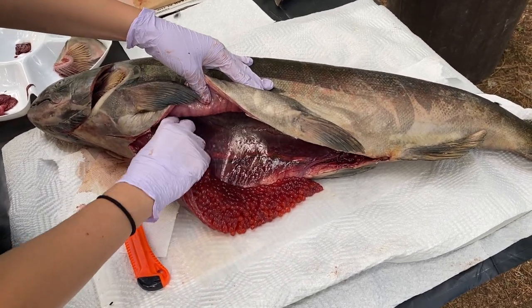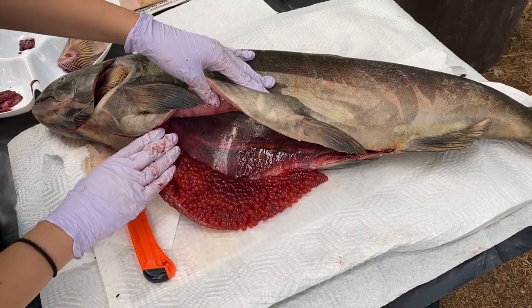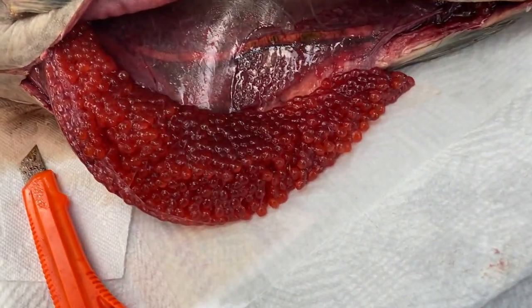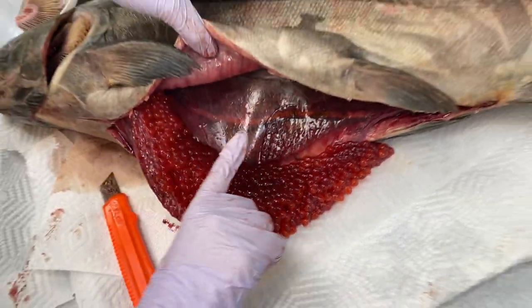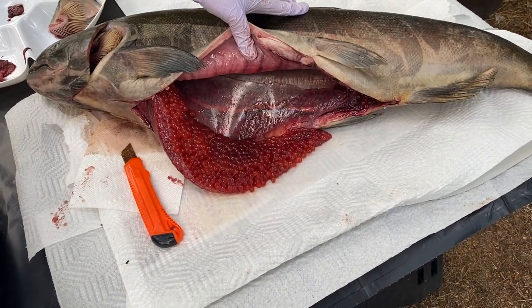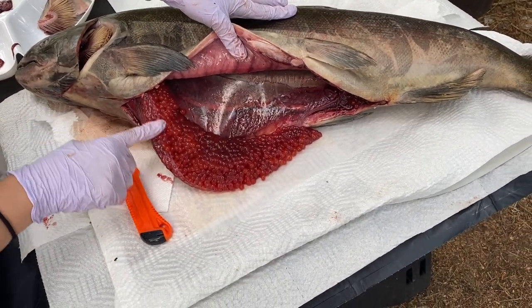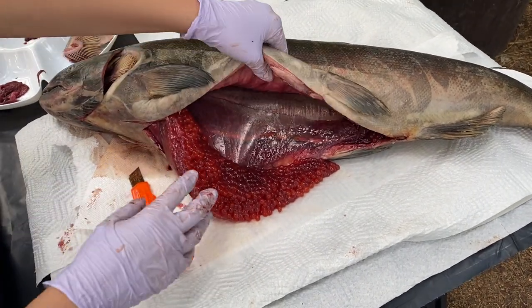And so we talked about how small their stomachs were, and we kind of brainstormed before when we were still in the classroom about why they would have to stop eating once they hit that fresh water. But if you see how much room their reproductive organs take up in their body, it makes it pretty obvious why they can't eat anymore. It's because they have to make room in order for all of these eggs to be produced, or in the male's case, the milt sac to be produced.